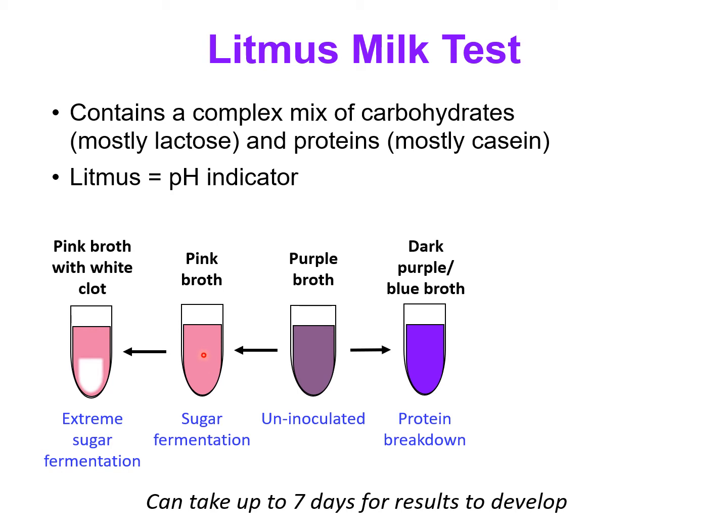So even if you incubate this test tube right here for a longer period of time, they're still not going to go through extreme sugar fermentation. But some bacteria strains, if you leave the test tube longer in the incubator, are going to go through more sugar fermentation and you're going to see that curd at the bottom of the test tube. So this is a group right here of some results that you can get.